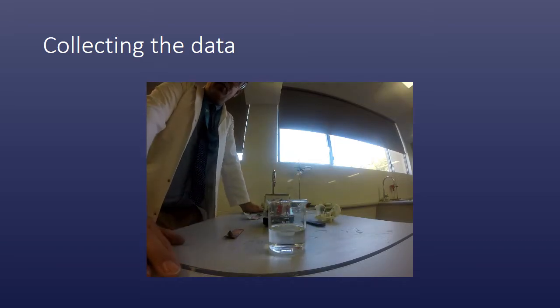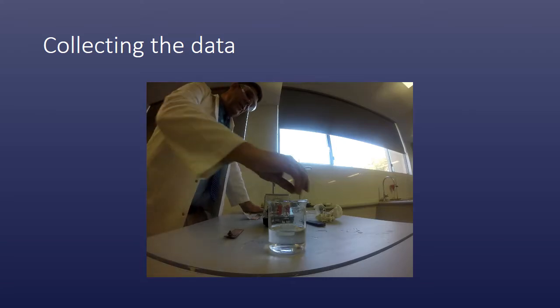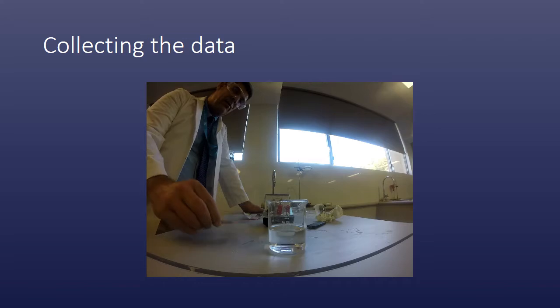A couple of other things that are important is the concentration of the solution or the electrolyte that allows us to have free ions available to move through the circuit, and a reasonable difference in the activity of the two electrodes in order that we may be able to see a difference. Of course, we know that the carbon, the graphite, is going to be an inert electrode, so that's not participated in the reaction. In fact, what's happened is, again, we've got a reaction between the hydrogen ions and the copper. Not a big one, but enough for us to generate a small amount of electricity.